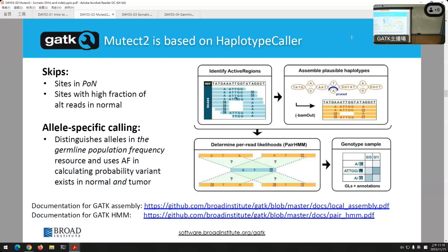And the flip side of that is when we're trying to assemble potential haplotypes from the normal cells, we're actually pretty permissive, maybe more permissive than normal. So for instance, any mapping quality. We don't do the Q20 cutoff. We're looking at normal cells. Well, we accept lots of mapping qualities there, okay? And I mentioned potential disagreeing reads that are overlapping. We'll keep them. We'll factor them in.